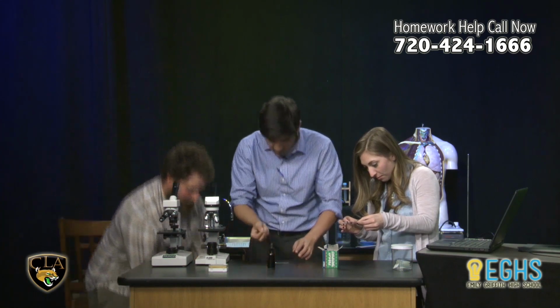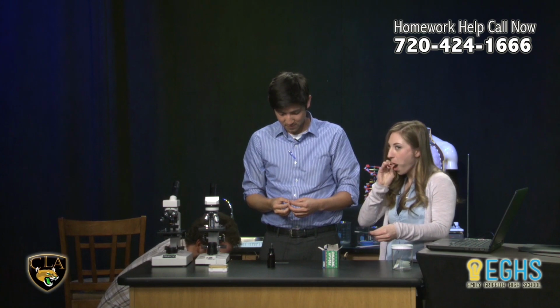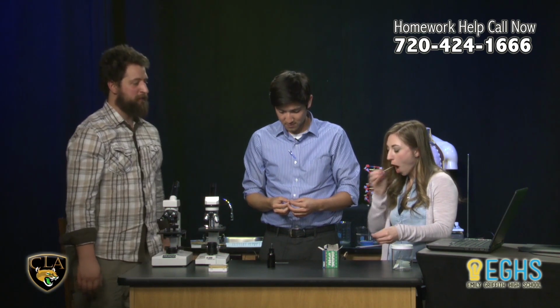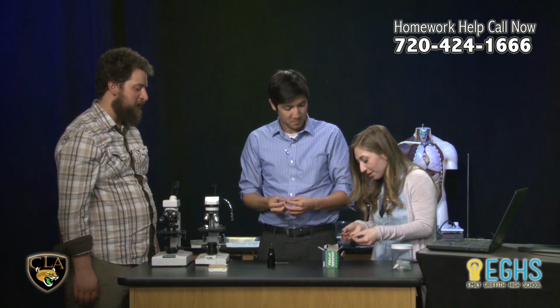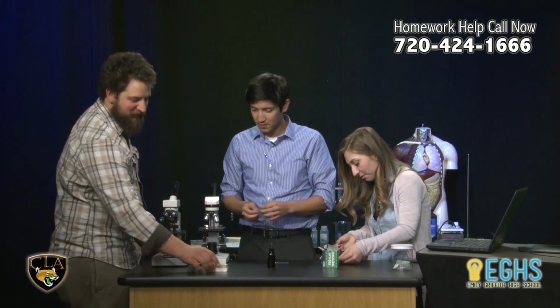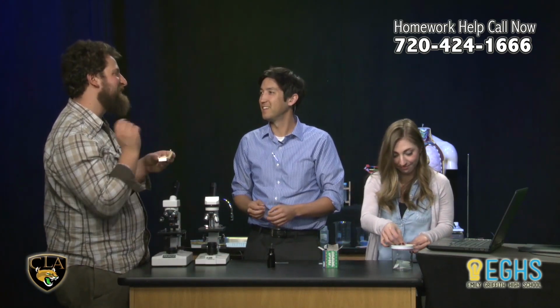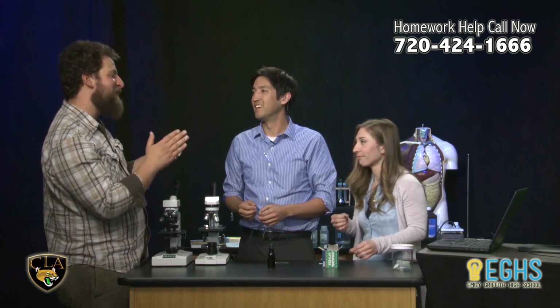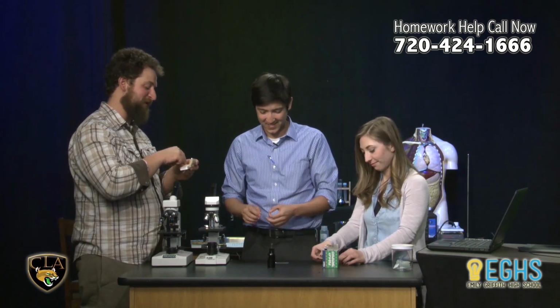And I'm just going to plug these microscopes in. I don't feel like I did it right. Hang on. Do you want to try again? You're welcome to grab a new toothpick. And you just dab it in there a couple times. You dab it in there, Nate? Yeah, I did. If we have any kind of an issue, we can always try again. You guys really did do small. I'm always really on my students about tiny dots, but to them, a tiny dot is just so much of it. You guys took me really seriously.